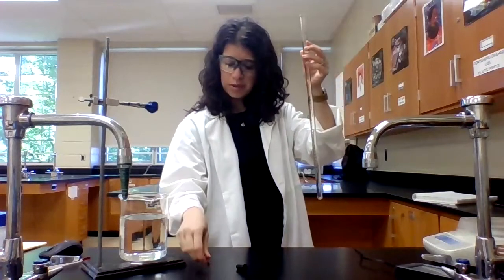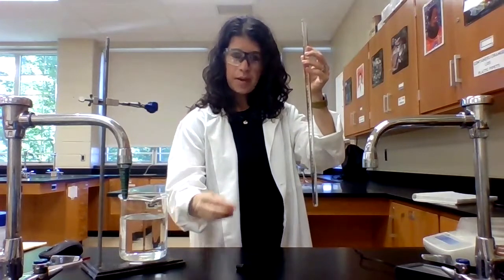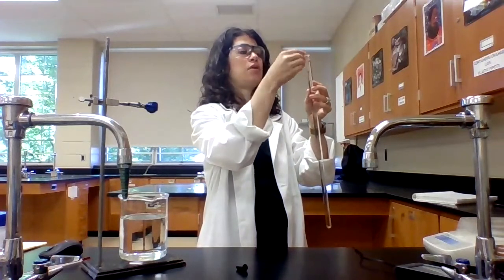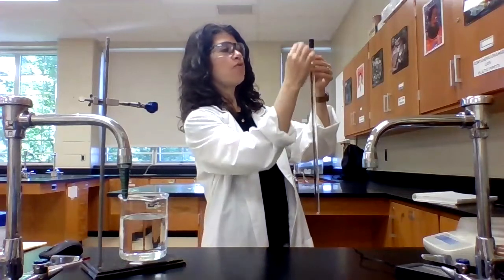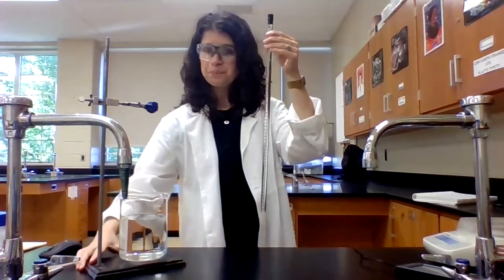So now what I'm going to do, I'm going to place my magnesium ribbon inside the eudiometer, and it's not going to react yet. Again, the hydrochloric acid being more dense is down at the bottom. So I'm just going to secure my magnesium ribbon and place the stopper. And a little bit of water came out, which is a good thing. That tells me there's no air inside the eudiometer. It's completely filled with the hydrochloric acid and the water.